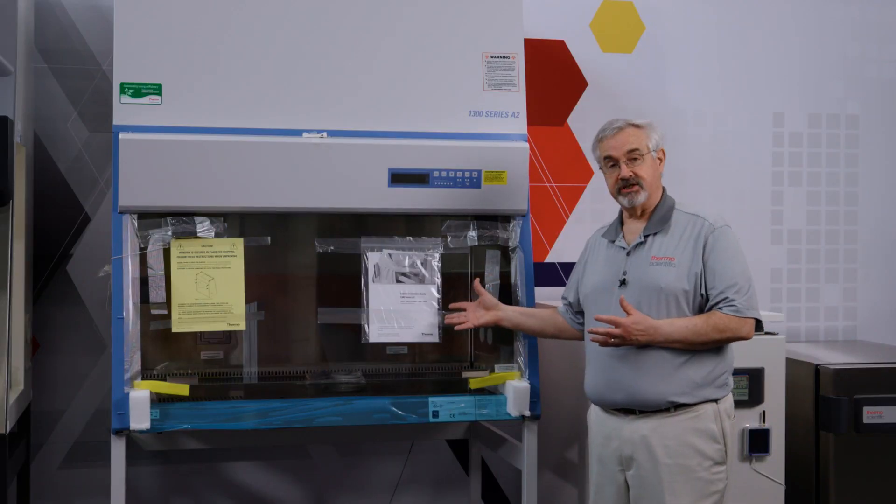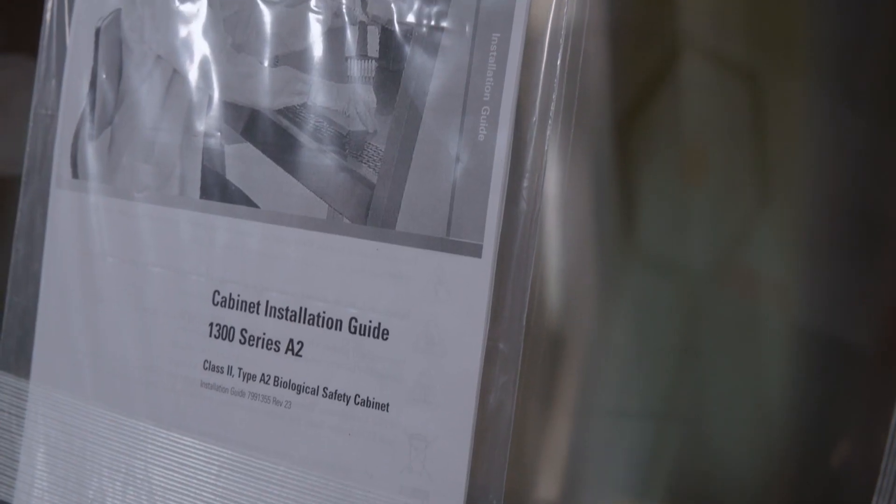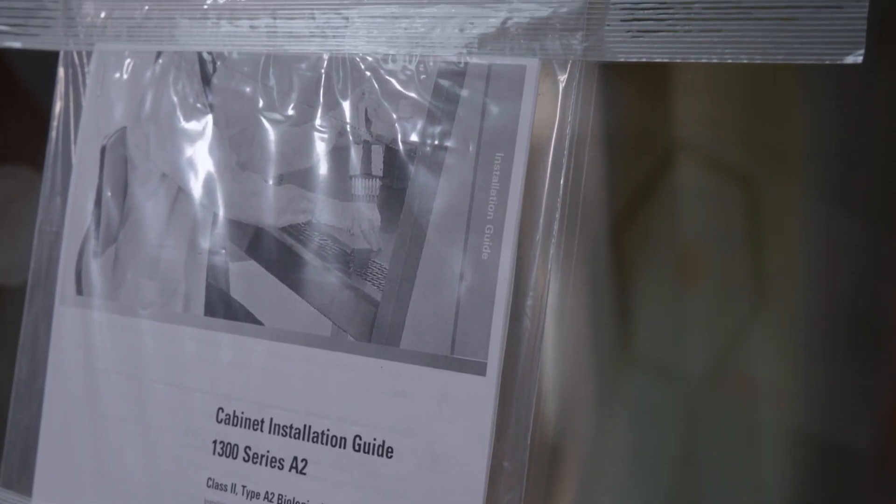The cabinet will have an installation guide attached to the front window. In the installation guide, it will describe how to unpack the cabinet from the pallet, which we've done, how to assemble the stand, which we've done, and how to place the cabinet onto the stand.